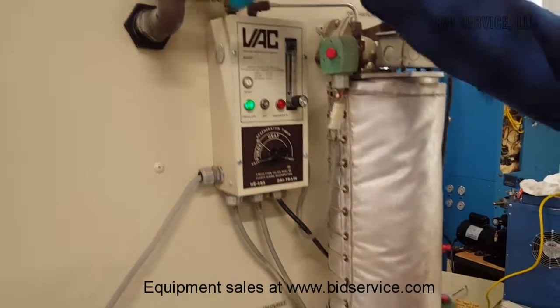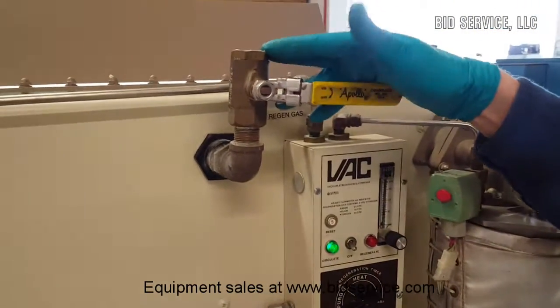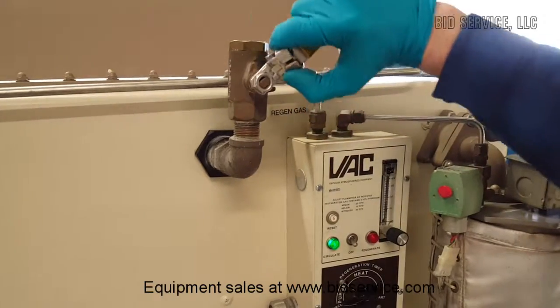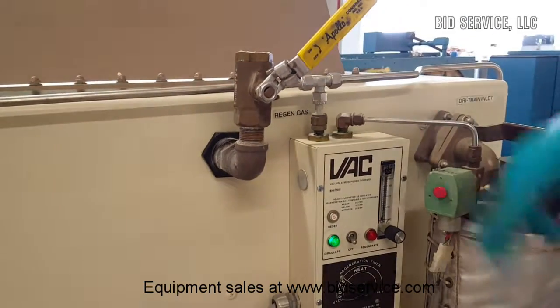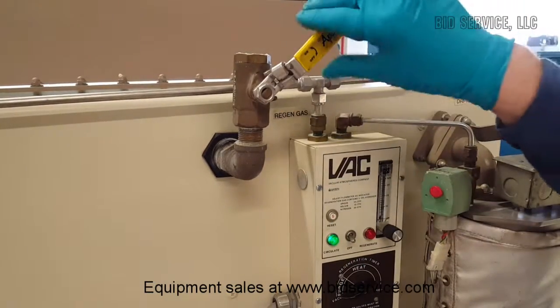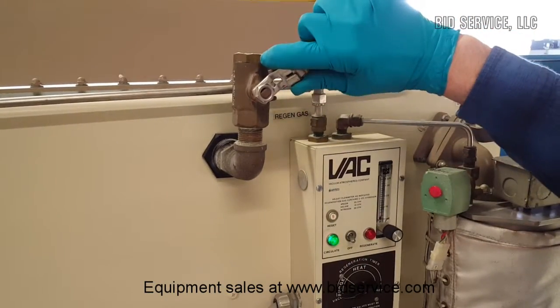Up here you have a purge valve if you want to manually purge your glove box. If I were to open that up, you can hear it's trying to maintain the pressure inside the box. You can do a quick purge using this manual valve.